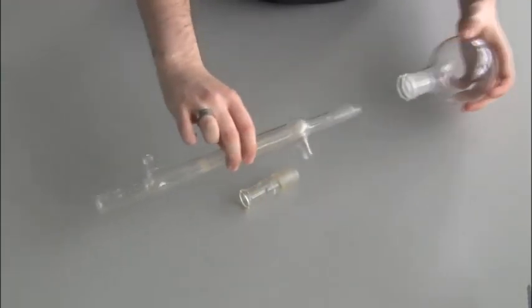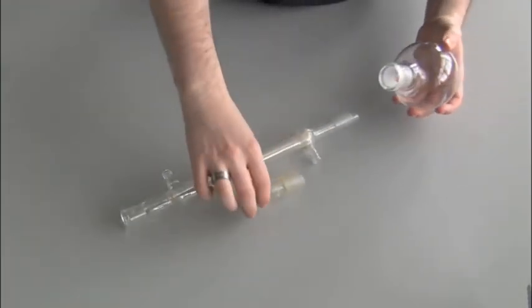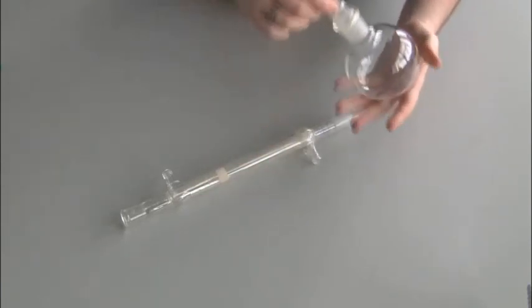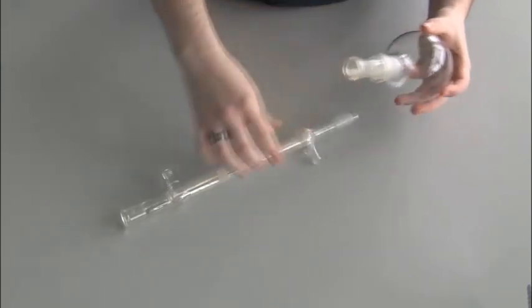If you have a set of Quick Fit Glassware where the joints are of different sizes, you can use an adapter. Notice that the seal is tight and not loose.